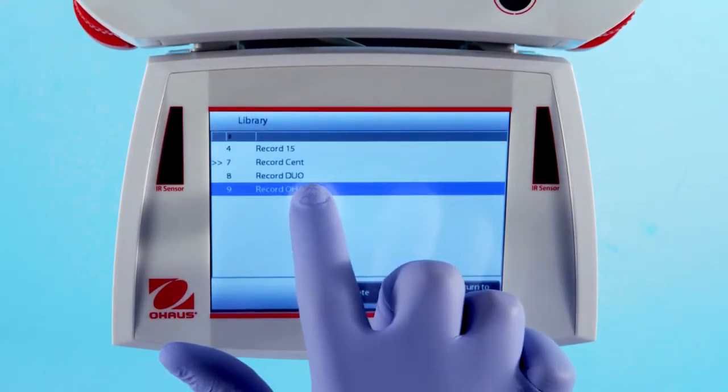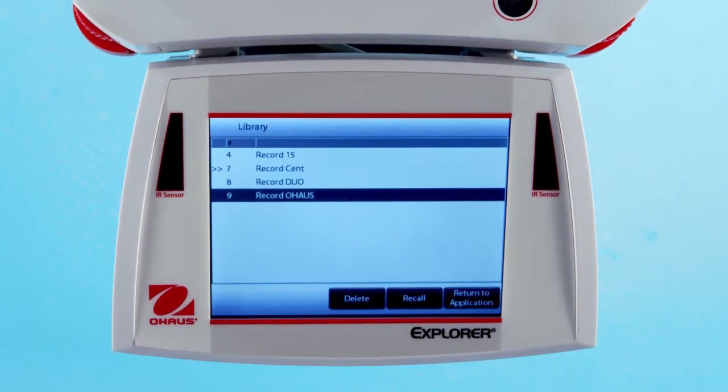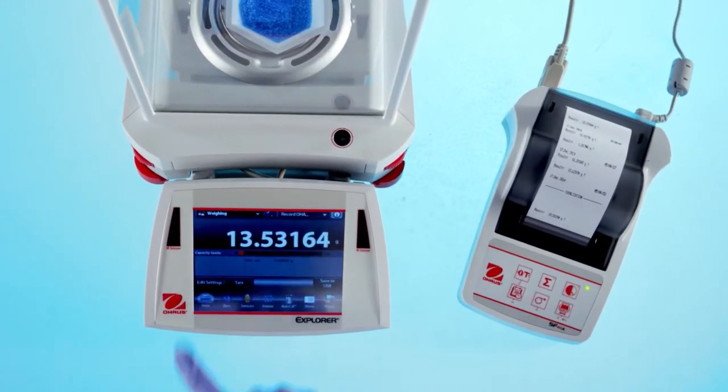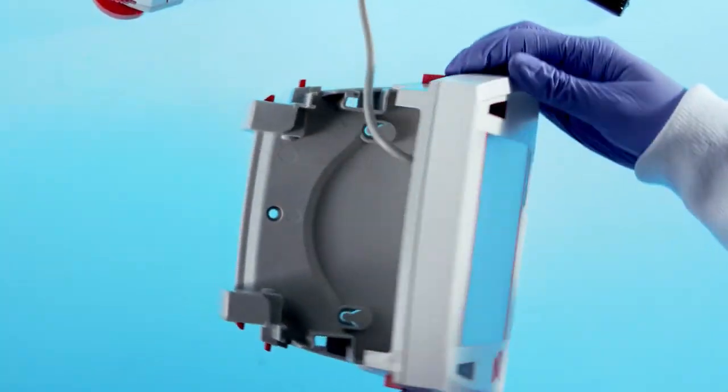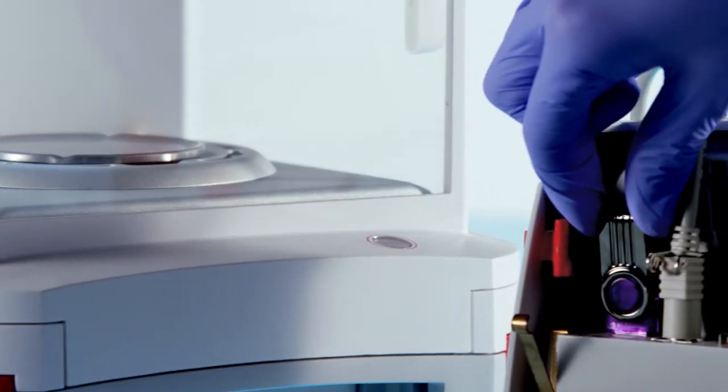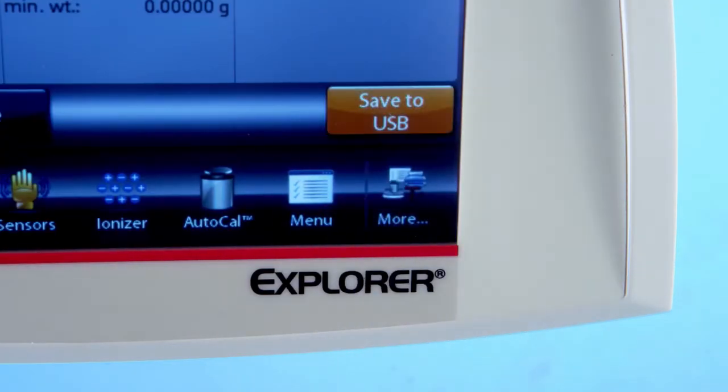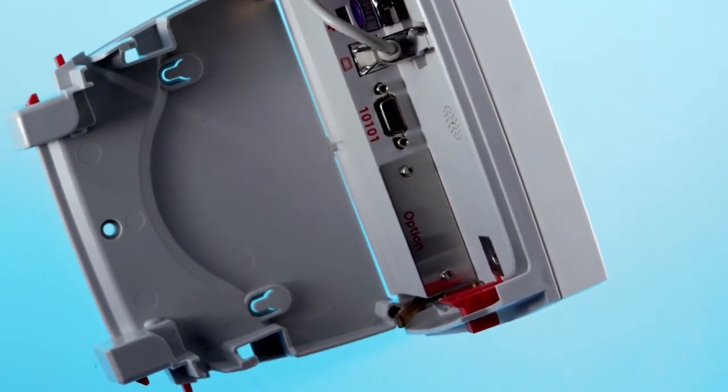Explorer features a 99-item library, formulation application with 10-recipe library, TrueType printing, and both USB and RS-232 connectivity, and an optional Ethernet connection.